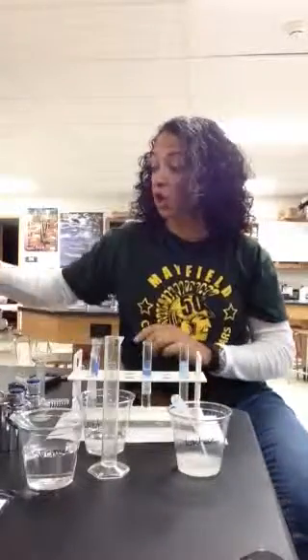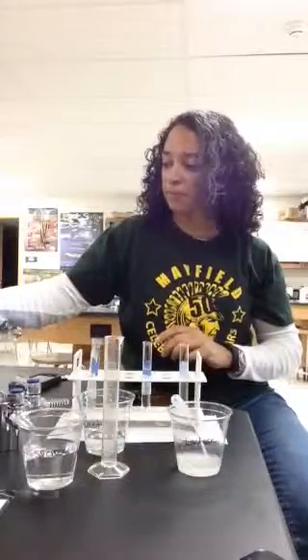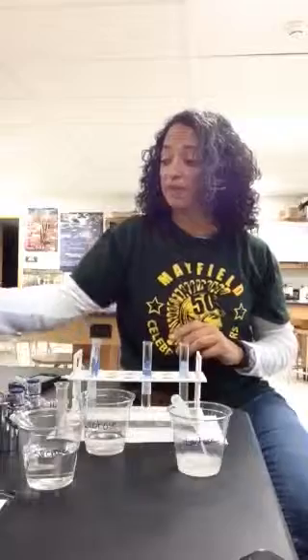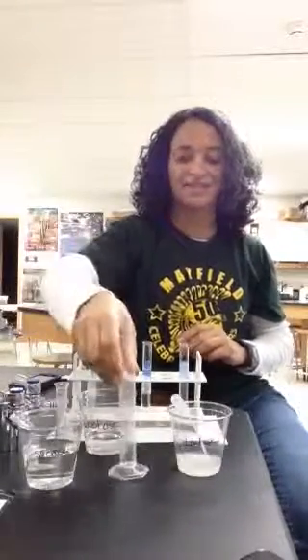While I'm waiting, I'm going to go ahead and rinse out my graduated cylinders so I know that they are ready for the next part of my experiment. Once you are finished reading your glucose test strips, you're going to repeat the exact same experimental setup with your sucrose to see if lactase does the same thing with sucrose that it does with lactose.